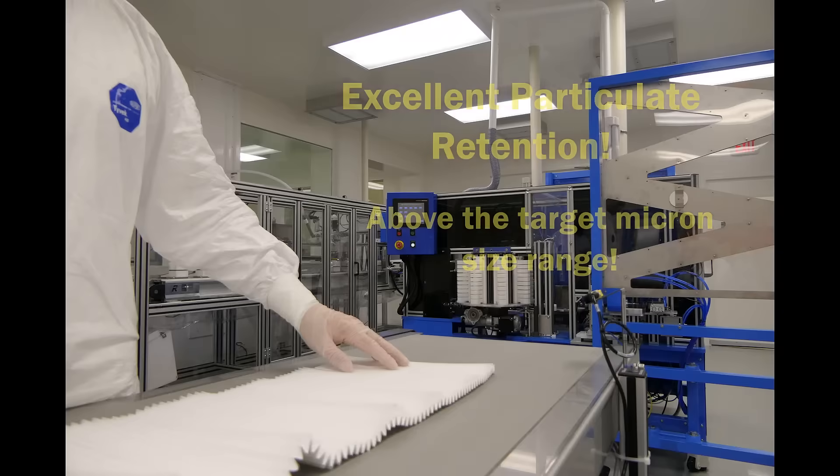Our filter media has excellent particle retention above the target micron size range.